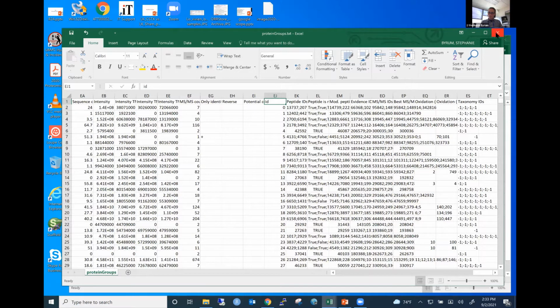So what we would do with the proteomics core: once you submit your samples, it goes through the mass spec, then the bioinformatics team takes over and processes the data. We do the normalization of all the data sets, and then provide the differential expression analysis at the end.